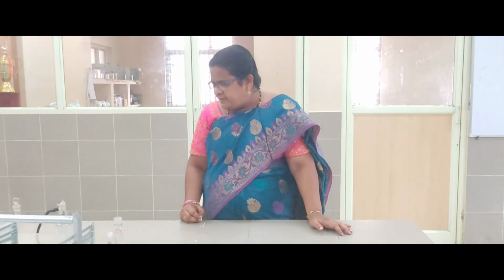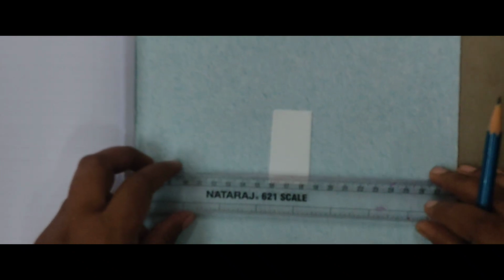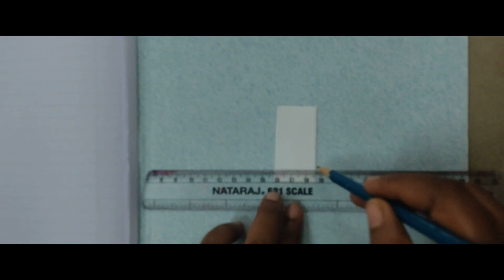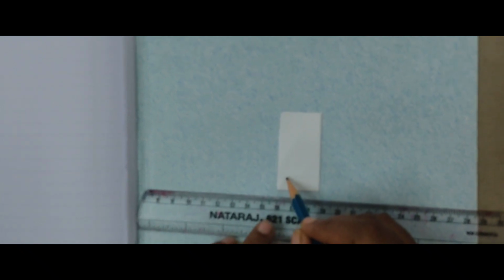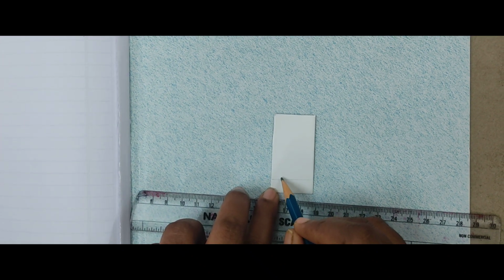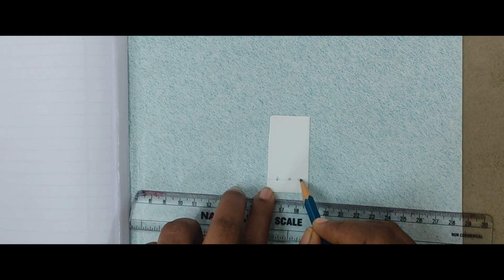From the bottom, 1 centimeter above, draw one horizontal line using pencil and ruler, and make equal circles at equal distances, mostly 2 or 3 circles.